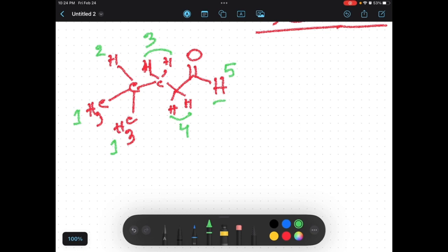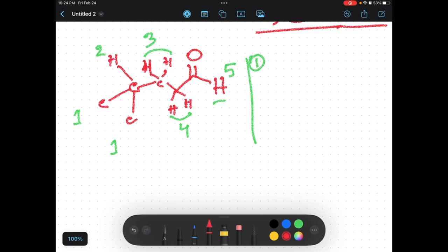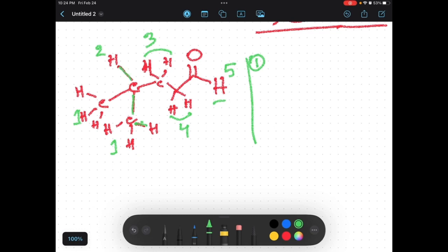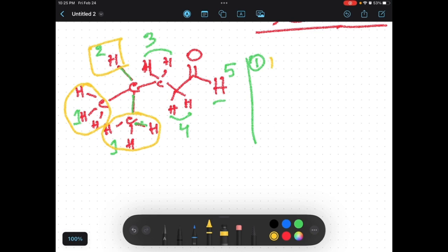Now assign the multiplicities. The methyl group (proton 1) — to show it more simply, this methyl has three protons and the other methyl also has three protons. For any proton from this methyl, counting one-two-three, that proton (number 2) is a neighbor. So all six protons from both methyls have proton number two as their neighbor — one neighbor total.